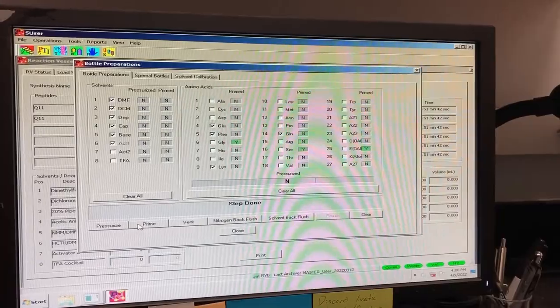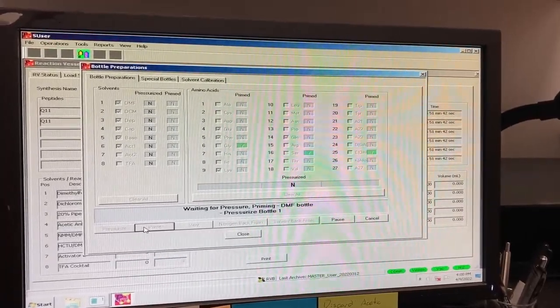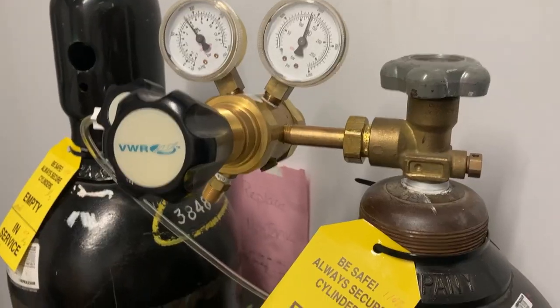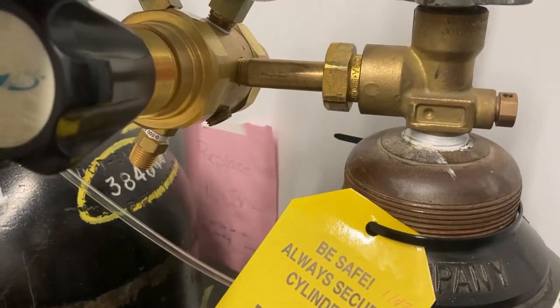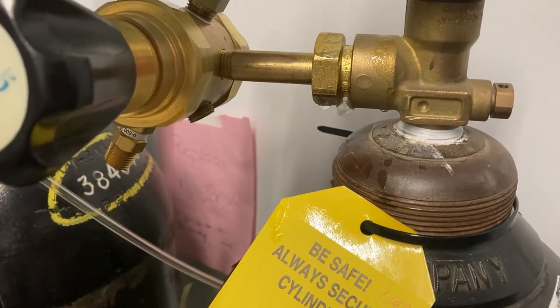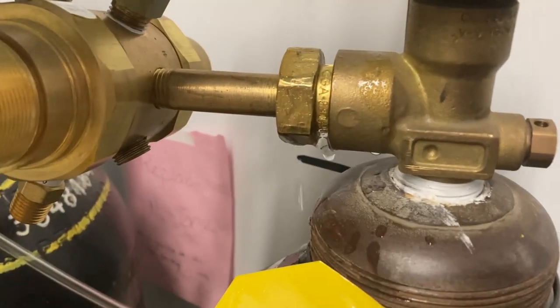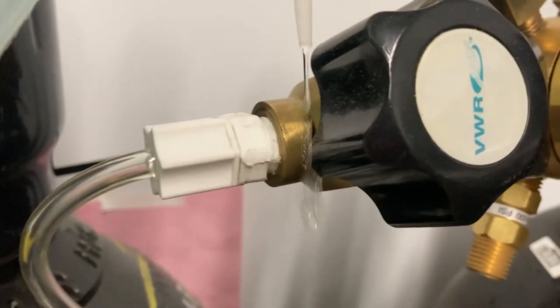During the pressurization step, check for any leaks around all connection points between the regulator, hose and tank by using diluted soap and water. If you see any bubbles form, you will need to tighten the joints or remove and reattach the regulator completely.